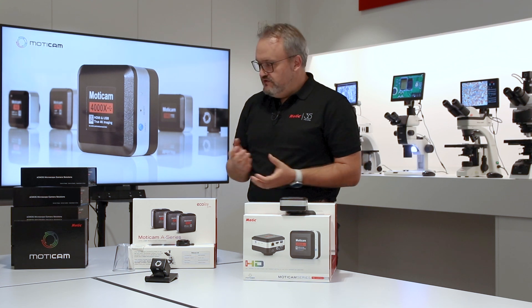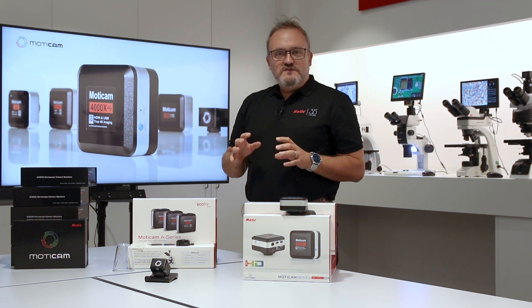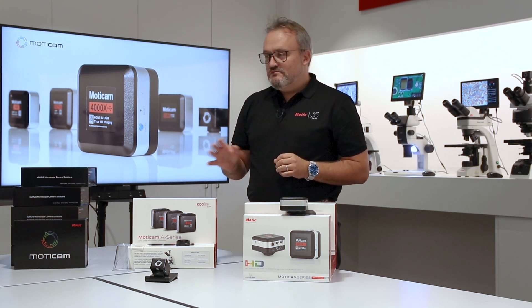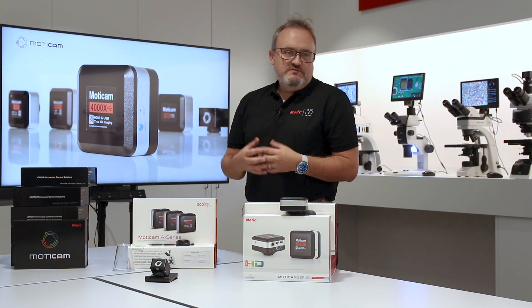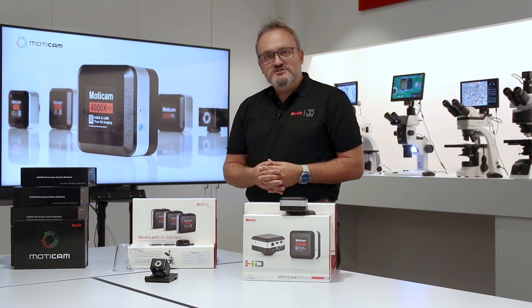We have global shutters and rolling shutters, different pixel sizes, and the color reproduction can be adjusted so that it is assured you can see exactly the same color representation on your screen as you see through your eyepieces — thus making professional or scientific research much easier.